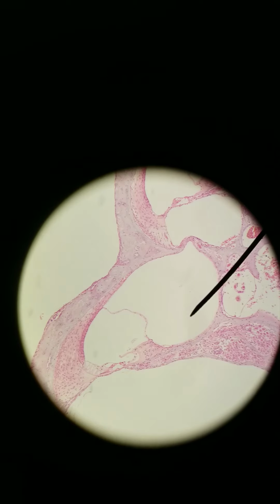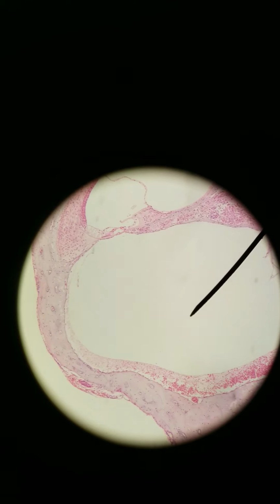It's the fluid waves inside of scala vestibuli that also vibrate the fluid inside of scala media. And then that vibration needs to exit out somewhere, so now you have a fluid wave exiting out through scala tympani. In reality, scala vestibuli and tympani are all connected, just at a single point. It's easier if I could unroll this for you, but we just have a slice to work with.